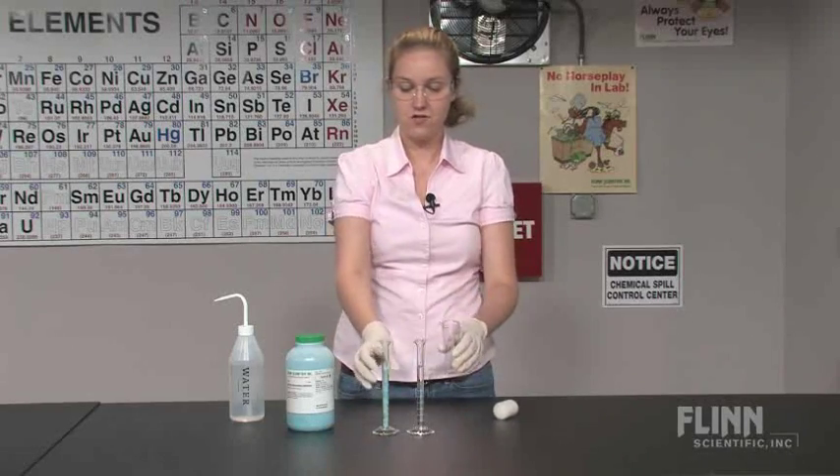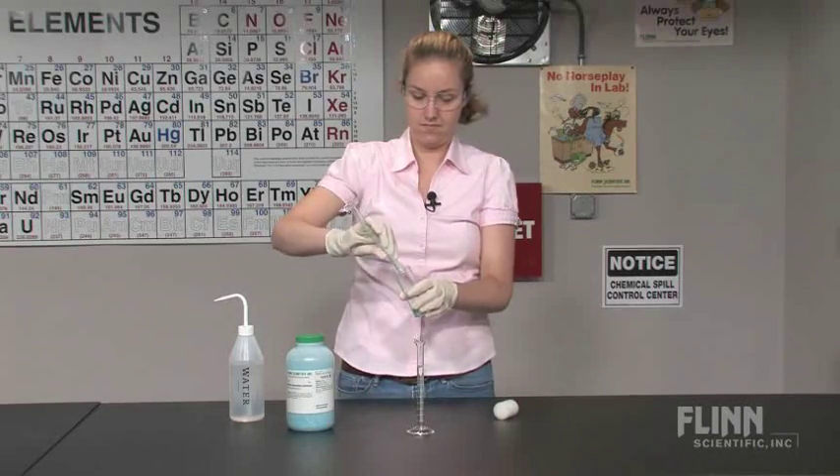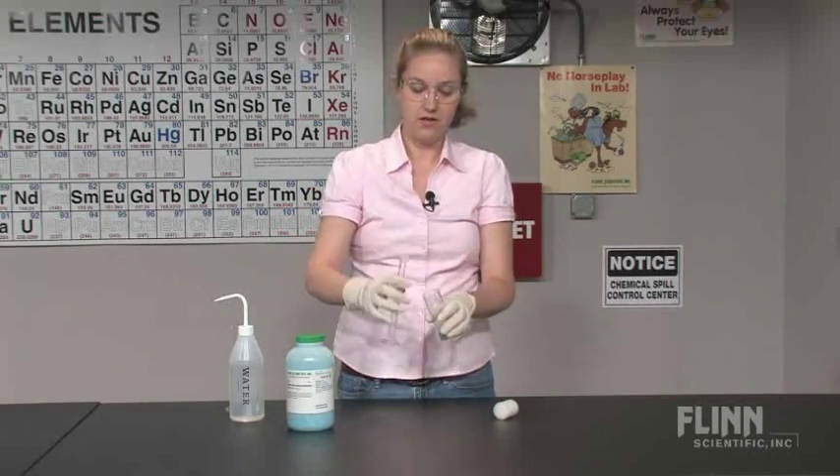Next, transfer the dry media into the culture vial. Then, add the water.